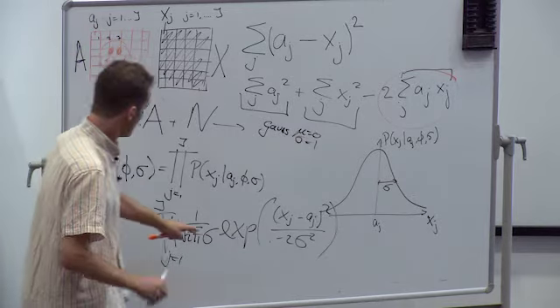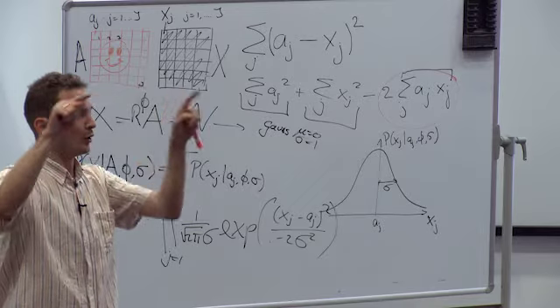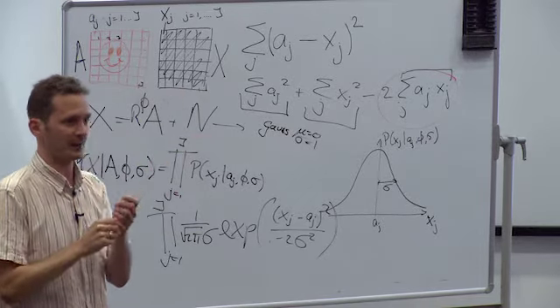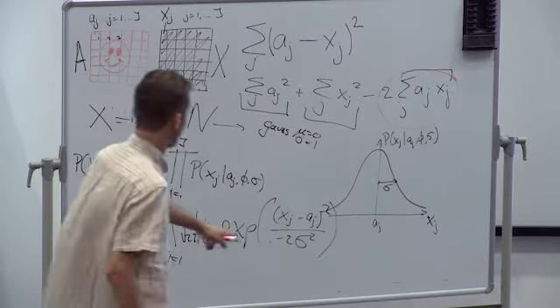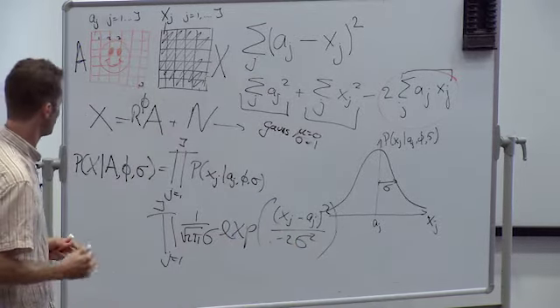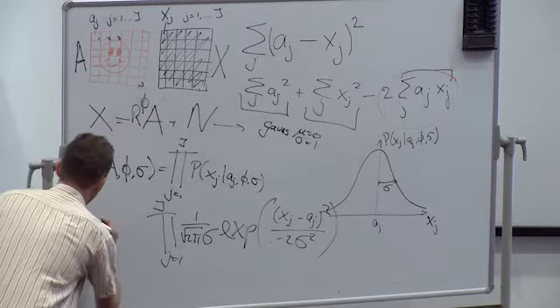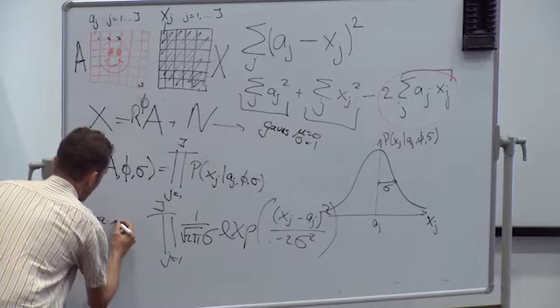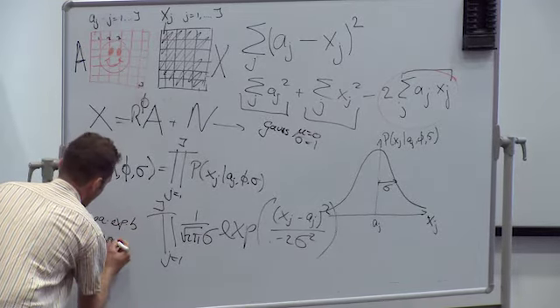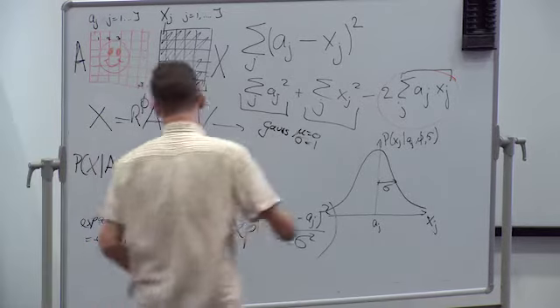The Gaussian is just an exponentiation of the squared difference between the mean and the actual value, divided by 2 times the standard deviation squared. Now, if you remember that x to the a multiplied by x to the b is x to the a plus b, then we're almost where I want it to be.